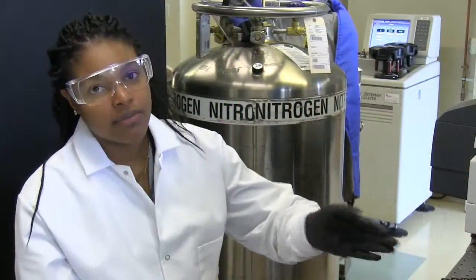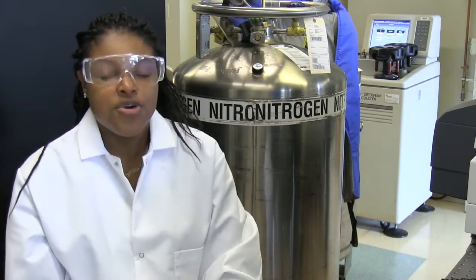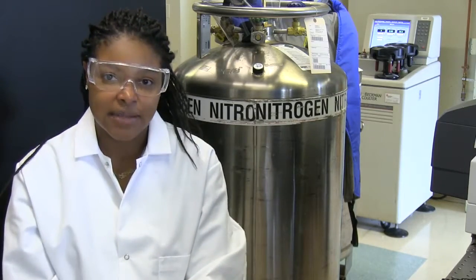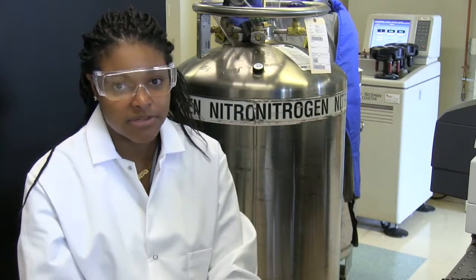So after we do the absorption spectroscopy, we actually take the sensors and we measure the fluorescence and how it responds to the hydrogen peroxide and the nitric oxide. And that's one thing that I'm learning this summer, how to use the fluorescence spectroscopy machine. I'm going to be making a 3D tumor model, which is really cool too.